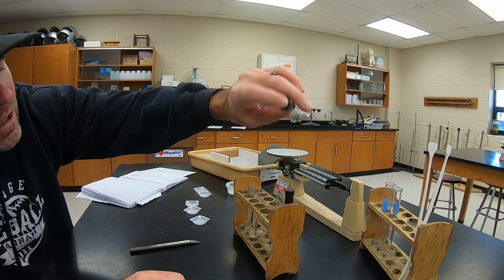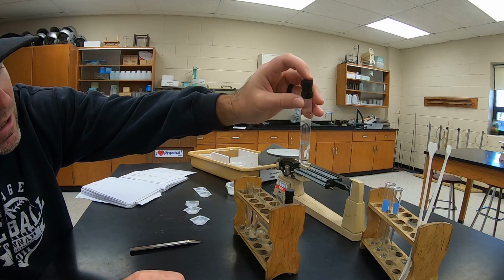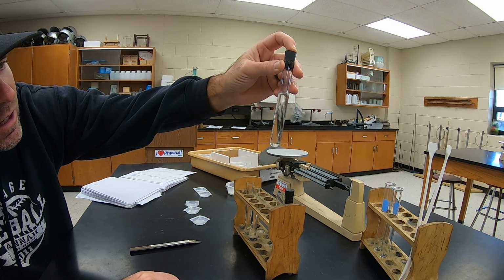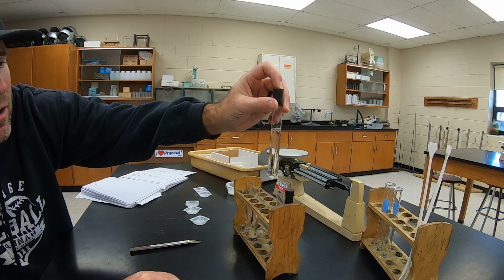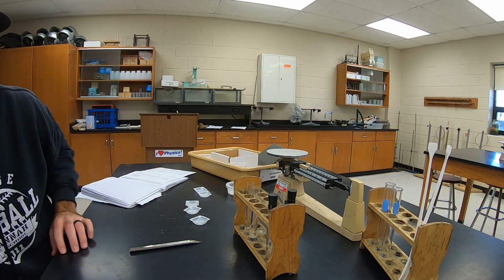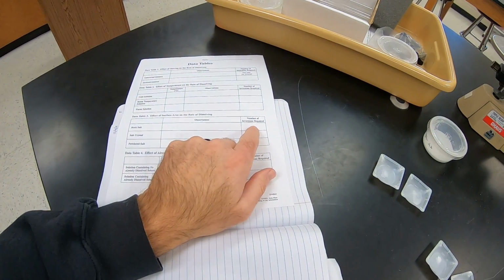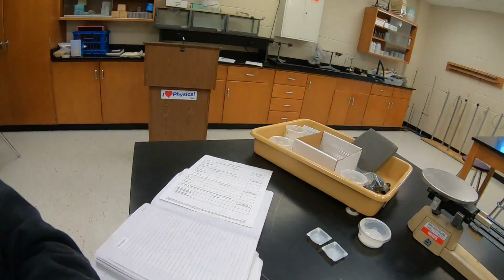16. Let's say it takes about 16 to get the rock salt dissolved. So in your data table for rock salt, put 16. Then we're going to do regular salt.